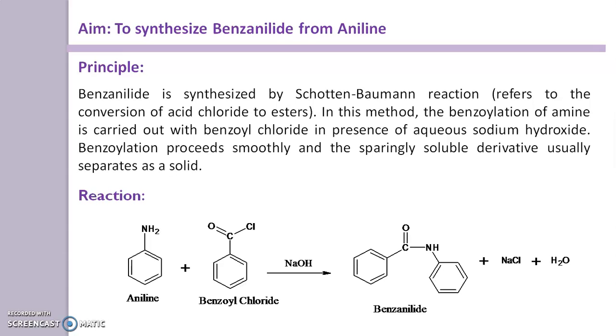Here is the reaction. Aniline reacts with benzoyl chloride in the presence of aqueous sodium hydroxide and it gives the product benzanilide with loss of sodium chloride and water. This sodium chloride remains in solution in a soluble form.